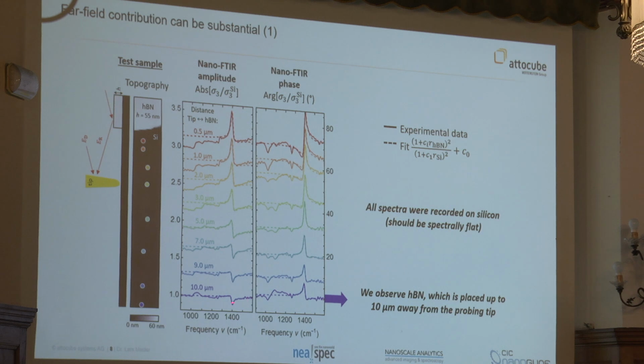And the surprising thing is we can even see this at a distance of 10 micrometer. It's a question that Fritz was asking. How far can you see this effect? 10 micrometer. This is measured in the infrared. So I would say on the scale of the wavelength, however large your focused spot is. So in this case, we see it. It's not what we want at all.